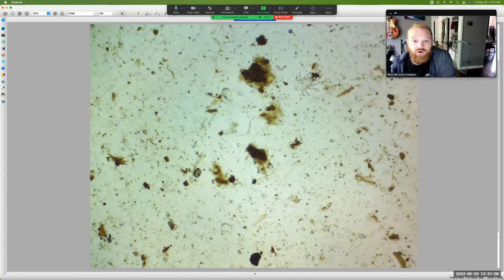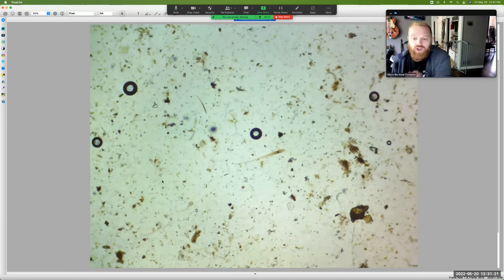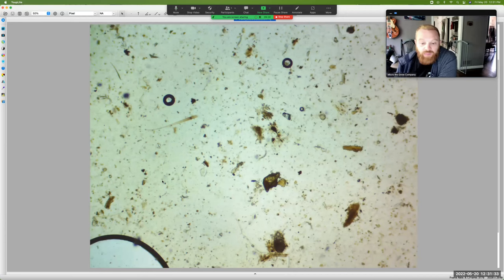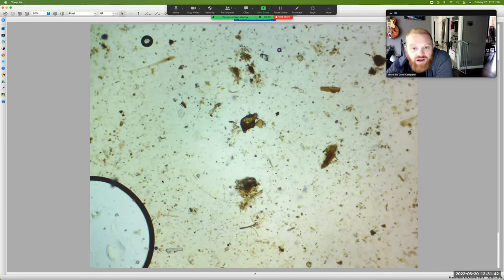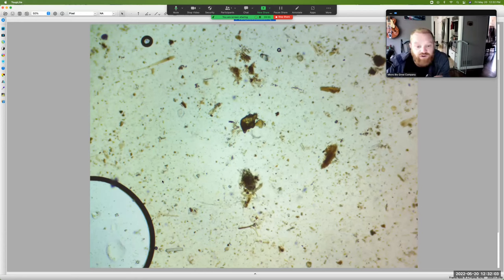More and more — there's those two we found earlier and that microarthropod. There's an air bubble we just passed, and there are more all over the place — holy smokes. We'll check that none of those are root feeders and extract those up. We got another macroarthropod moving around in this sample — look at him, he's stuck over here on his aggregate. This stuff is just cranking along and he is not dead — he is moving. We haven't even drilled down to see the bacteria yet.